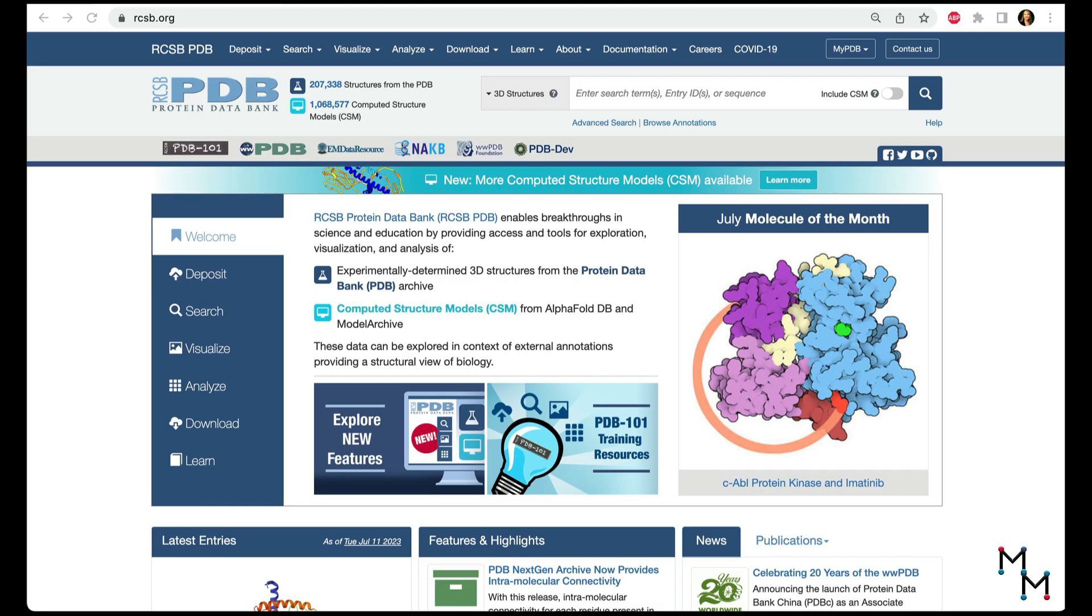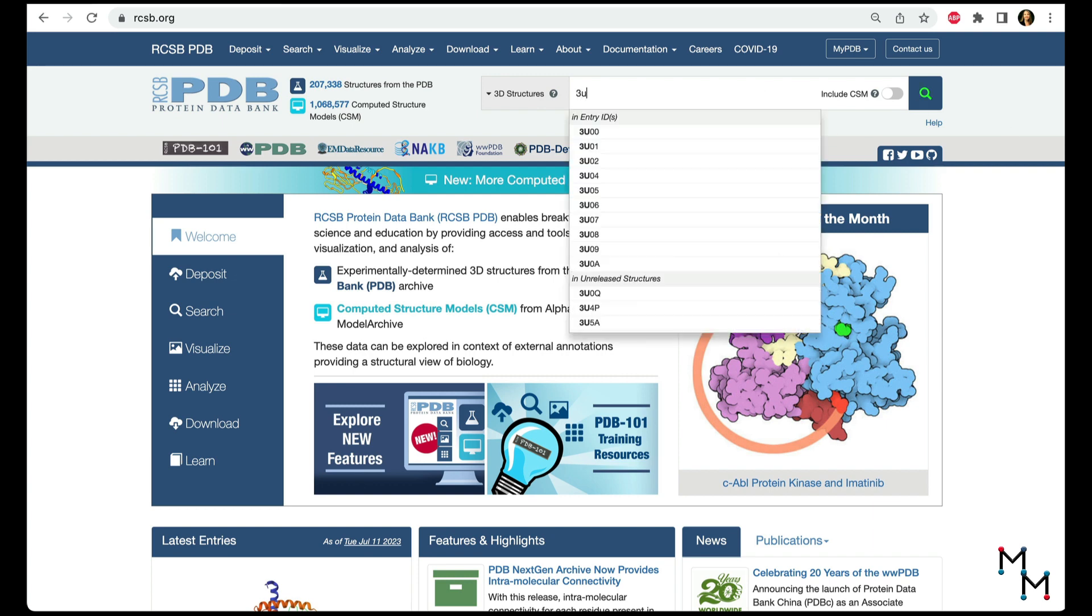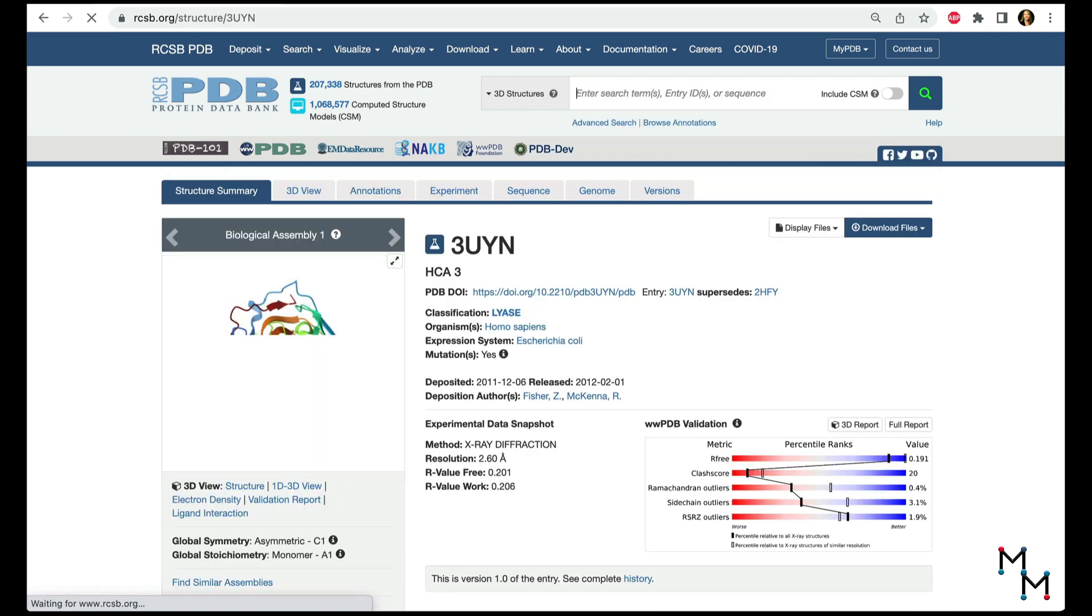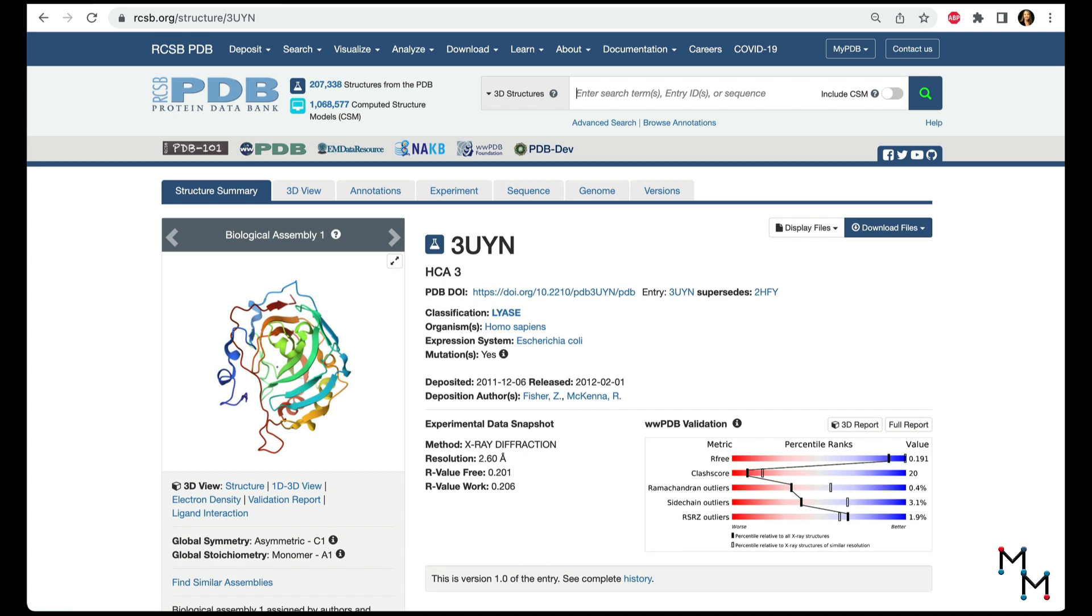We'll start in the RCSB PDB with the structure of carbonic anhydrase from the previous lesson, PDB ID 3UYN. Given the beautiful, complex-looking structures we've seen in the first two lessons, you might be surprised to learn that the input file type is simply a text file.